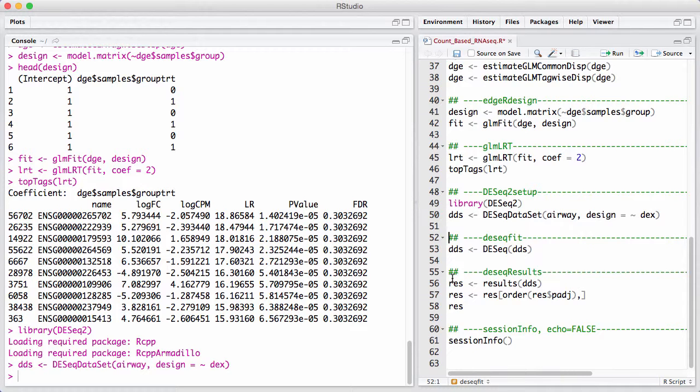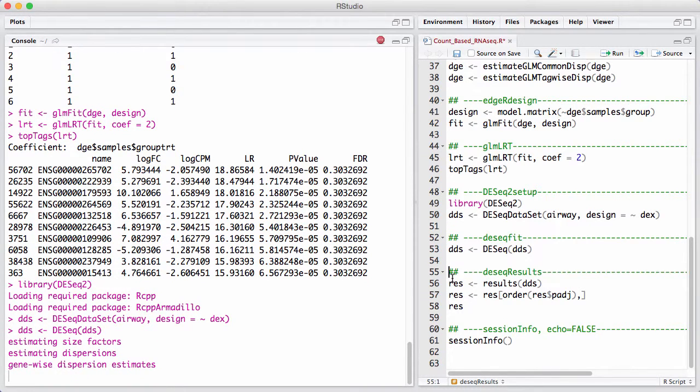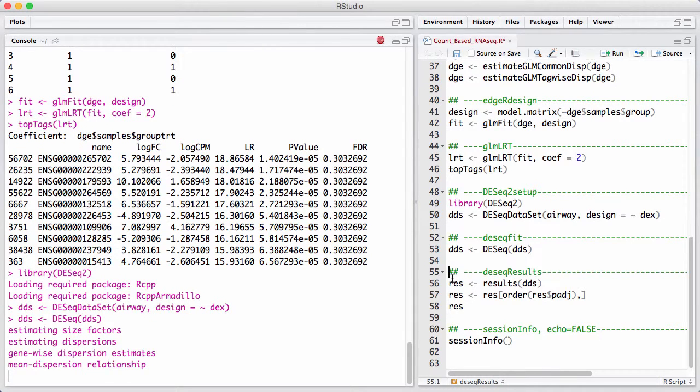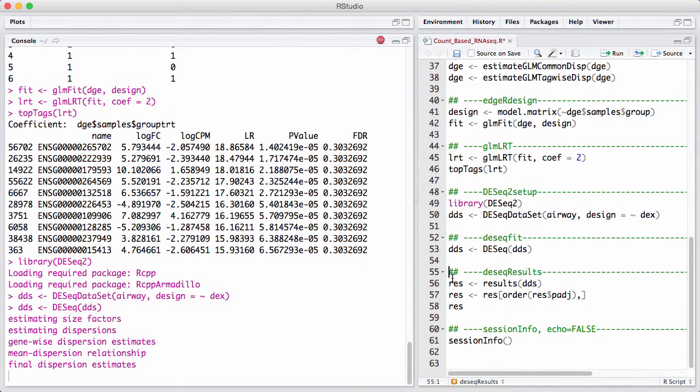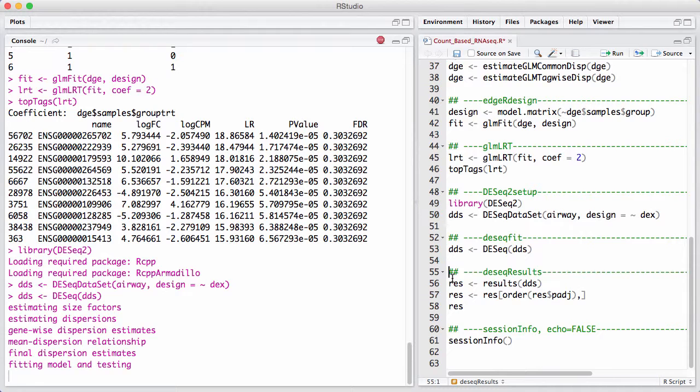Now once we have set it up, it's actually quite easy to fit the model, because all you run is you run DESeq on your data container. We can see that it's actually very similar to what happens with edgeR, it estimates size factors or library sizes or norm factors. Then it estimates dispersions, and then it fits the model and the test. So this is really a lot of different edgeR commands wrapped into one.